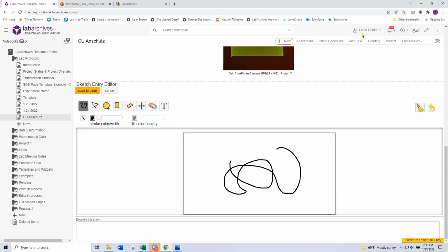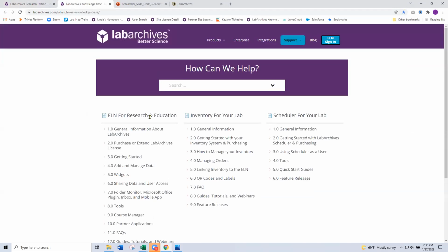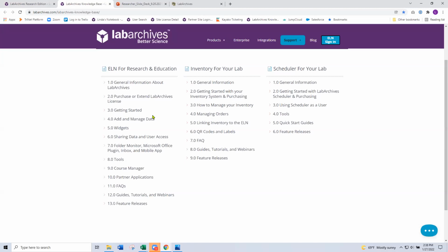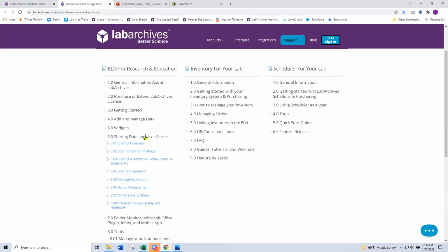That, Pete, what I will do for you, there's a section in the knowledge base. If I can quickly find it, I'm going to give it to you right now. So just bear with me. Maybe I'm not going to be able to find it as quickly as I had thought.